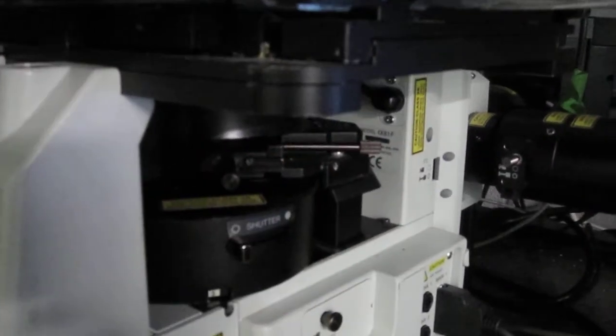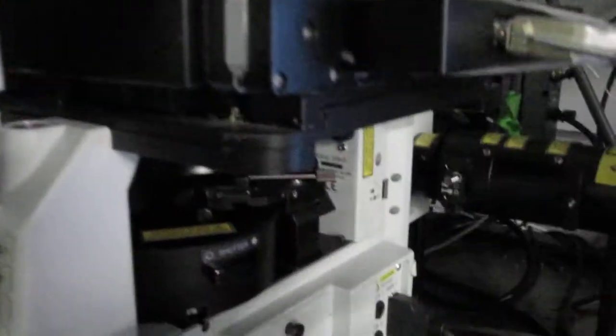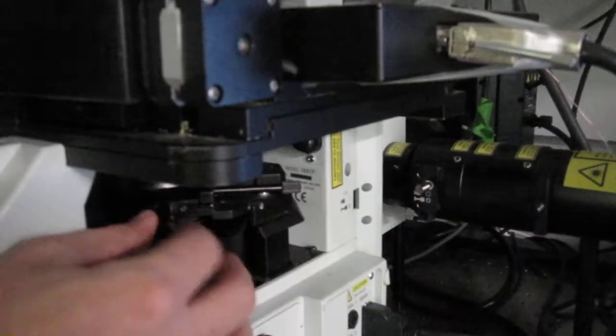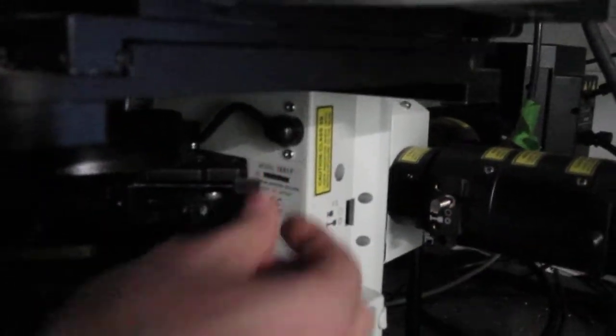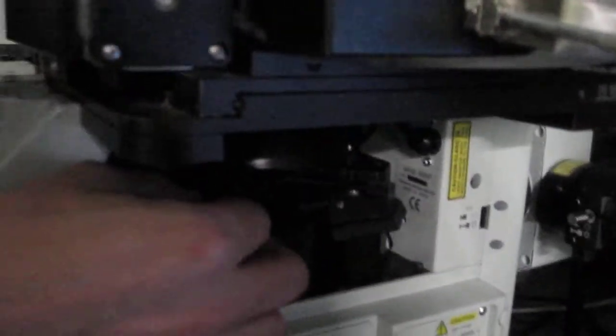And then with this regulator here, we're going to adjust the alignment of the different prisms, which will change the contrast that we get in the DIC image. So once we have the image in focus, we're going to change this up and down to get the best image possible. Another important thing to do once this is in, we want to screw this in to fix that in position, because if we don't do it, then this may wiggle up and down, getting things out of focus.